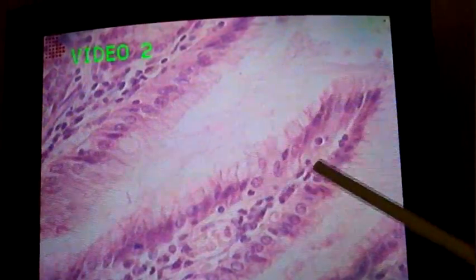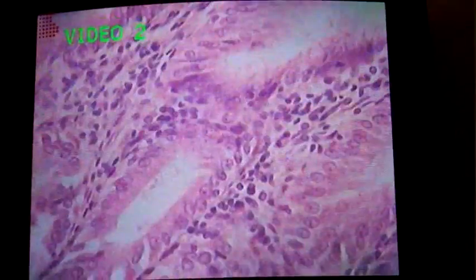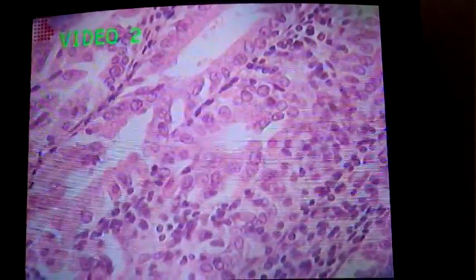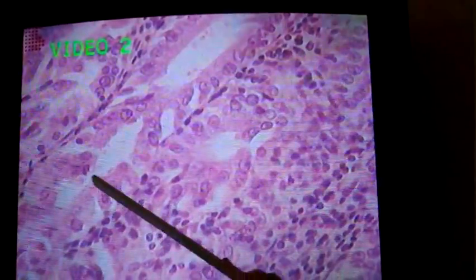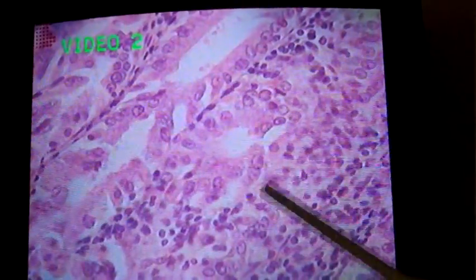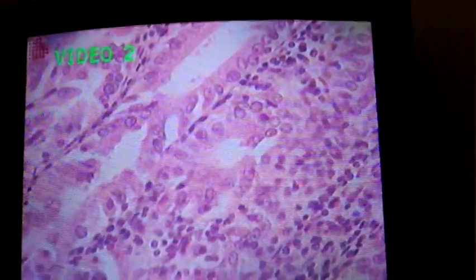Below the mucosa, we can see a finger here of the submucosa, and that's just going to be our connective tissue that's going to help connect that to the layer underneath. If we drop down, you see more of that submucosa. You see some more foldings there where we see the epithelium. Here, for example, is a really nice columnar cell. And again, more of that submucosa there.